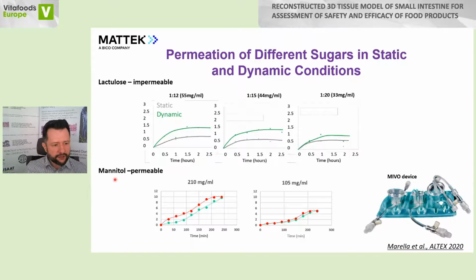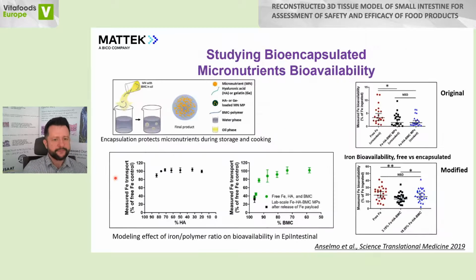This is also very interesting because the previously mentioned CACO2 model is virtually impermeable for mannitol. The mannitol is actually used as a control of integrity in this kind of models, but it's not really physiological because mannitol is absorbed in human.